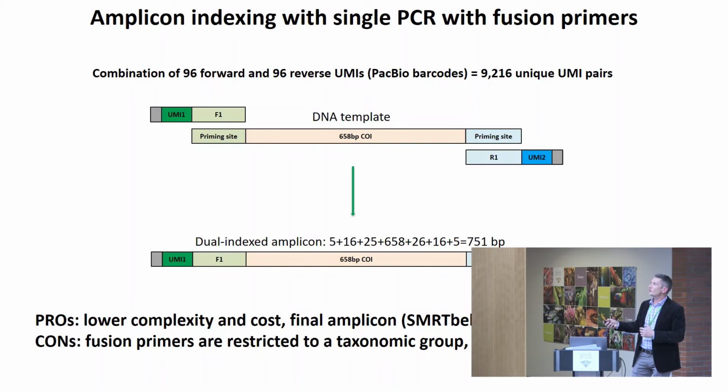If we improve the efficiency and we want to have a very specialized system, we can further drop down the complexity of the sample prep and make something to make Paul very happy, because all we care about is just to barcode the Malaise trap samples at the absolutely minimum cost.